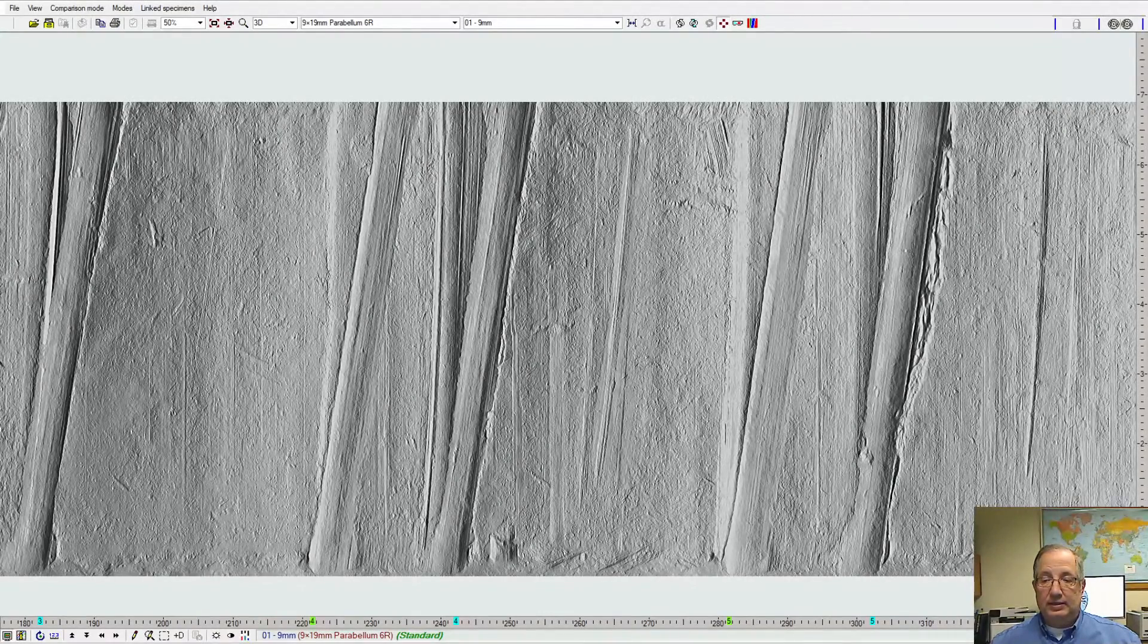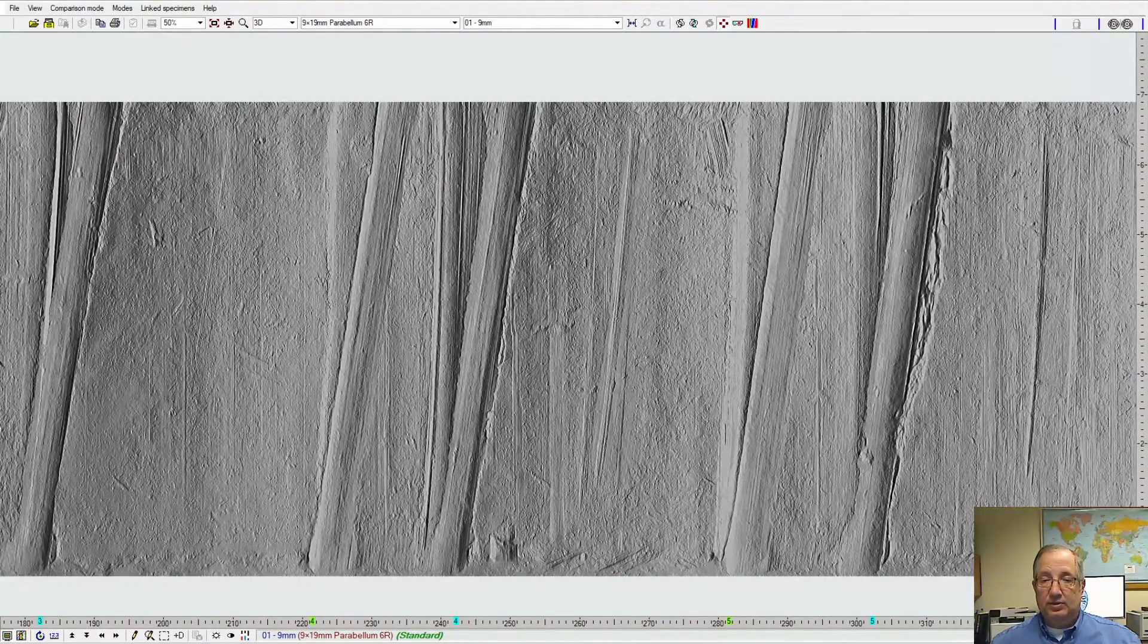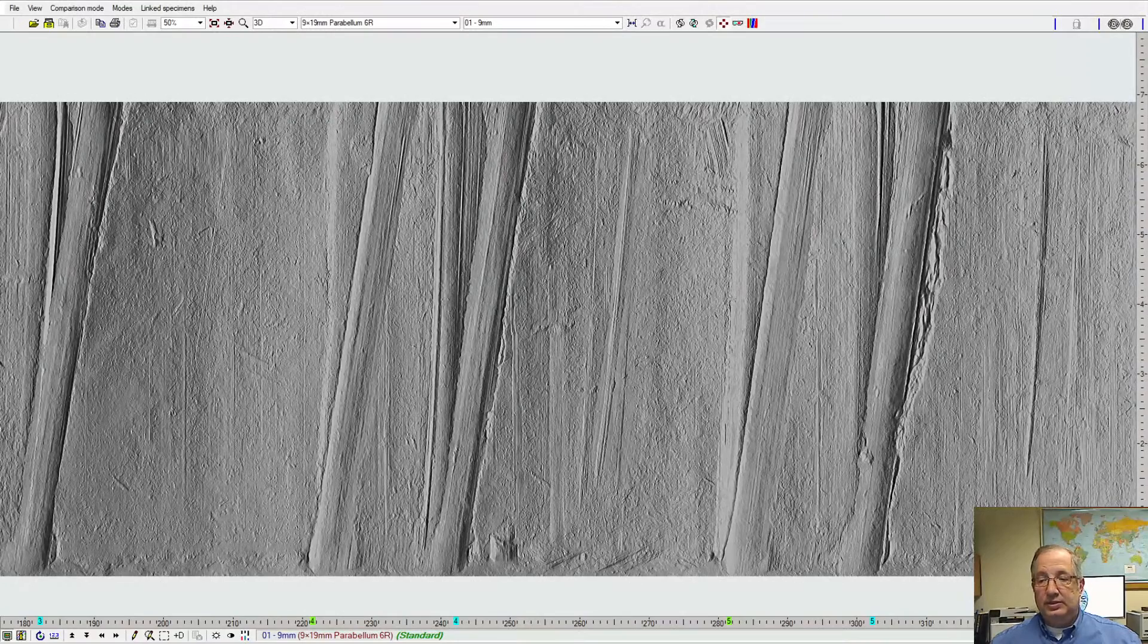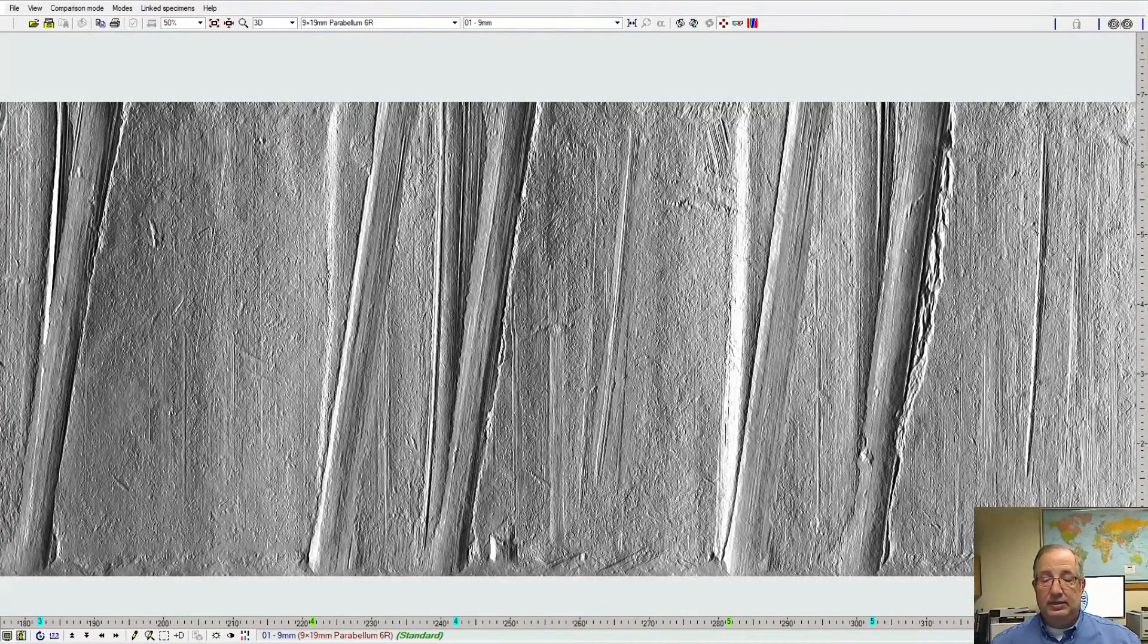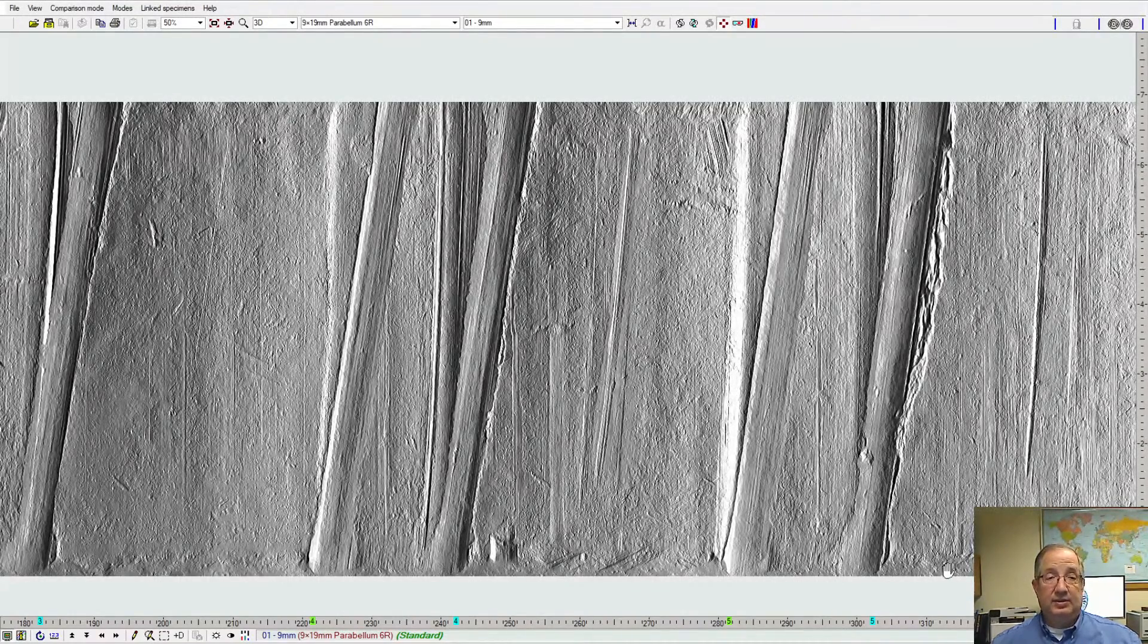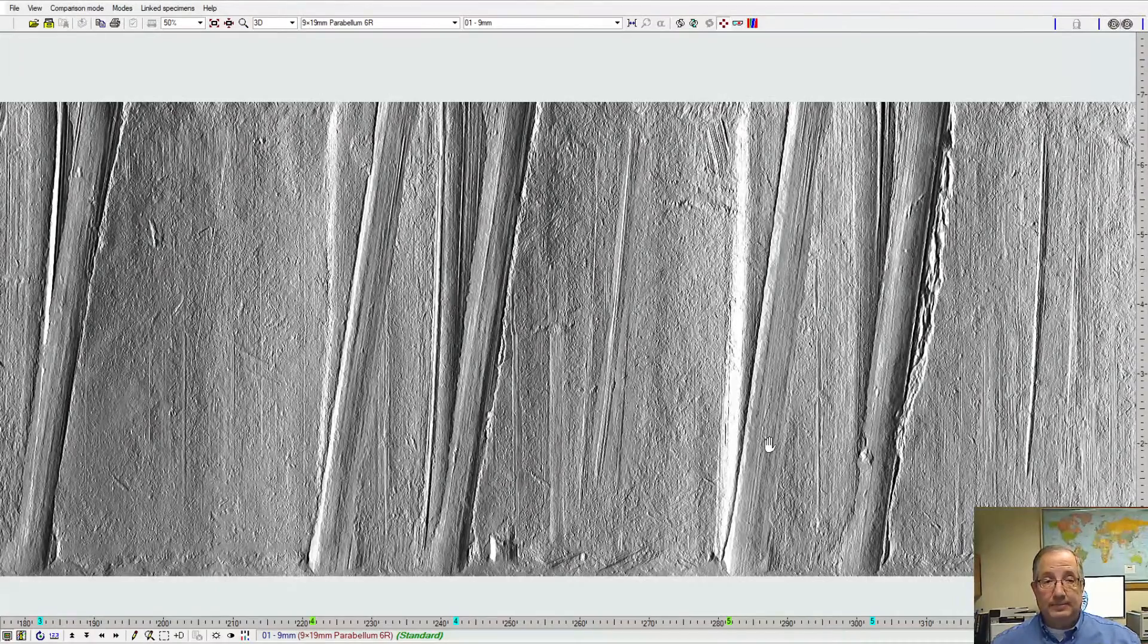Again, here's our brightness and contrast controls, and use these to be able to manipulate the sample to see it from the orientation and lighting characteristics that we want.